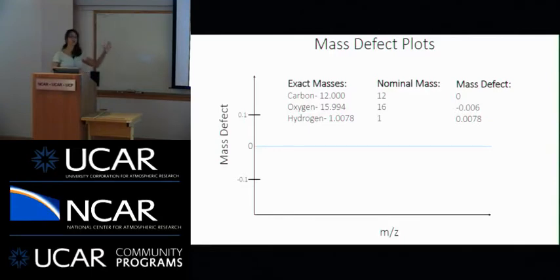So what I'm going to do is show you a few mass defect plots. So for those of you who do not do mass spectrometry in the room, I will give you a primer. So the idea here is that along the x-axis, we have mass to charge ratio. We assume that the charge in everything is 1. You can think of this x-axis as basically being molecular mass. And then we have our mass defect on the y-axis.